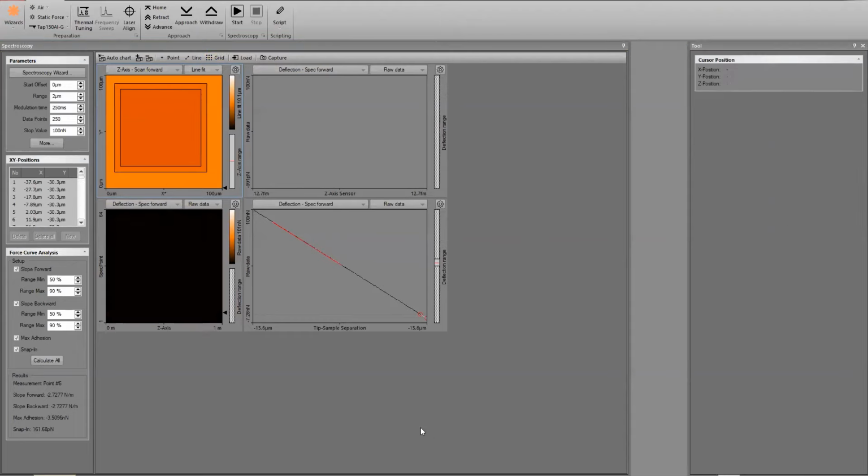I have another one. Are all AFM systems capable of doing this type of measurement? Yes. There is, though, a difference in the accuracy that you can reach. With Core AFM and FlexAFM, you can go to higher resolution spectroscopy. We have a more sensitive photodiode in it. And these systems are able to do thermal tune. But that doesn't mean that you cannot do it with Nano AFM or with a system with an EasyScan 2 controller.